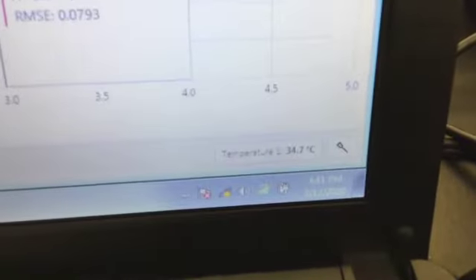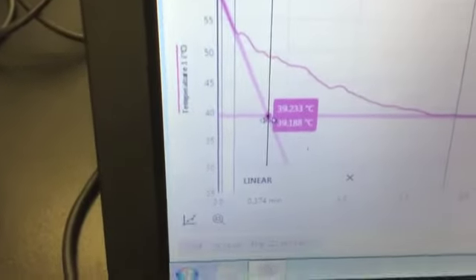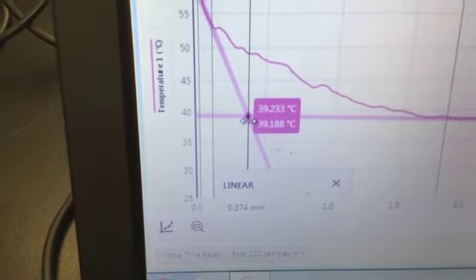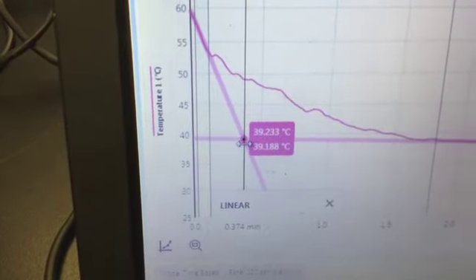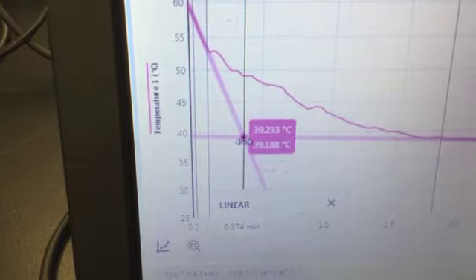If you look in the other corner, you will see that the temperature that we are collecting only has one decimal place. And this is the extent to which we have accuracy or precision in our collection methods. So therefore, when we are collecting our data and determining the melting point, we should only collect it as far as this point. This is okay because remember that our freezing point constant only has two significant figures, and so having three significant figures on our temperature will not affect our results.